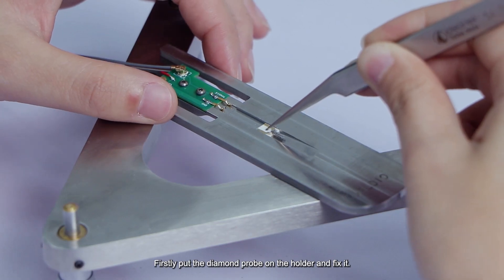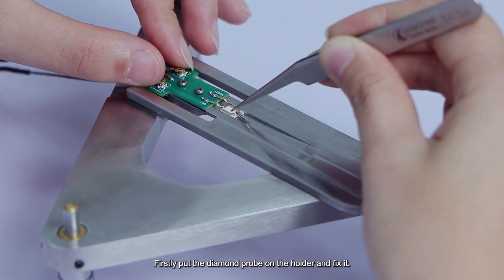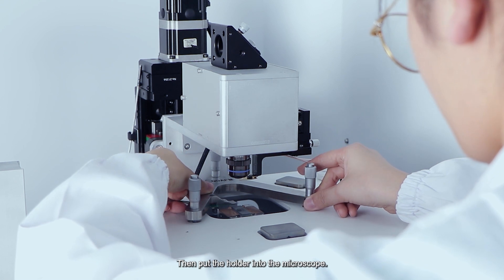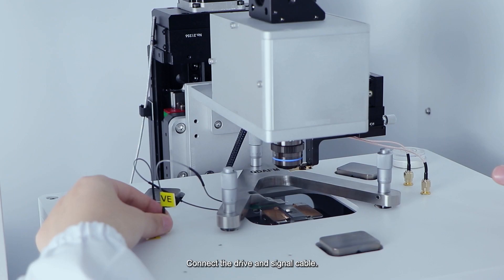Firstly, put the diamond probe on the holder and fix it. Then put the holder into the microscope. Connect the drive and signal cable.